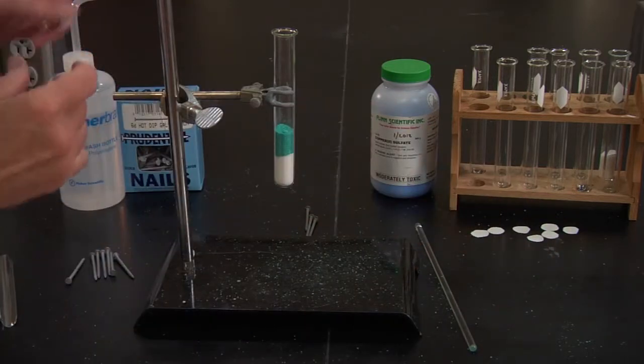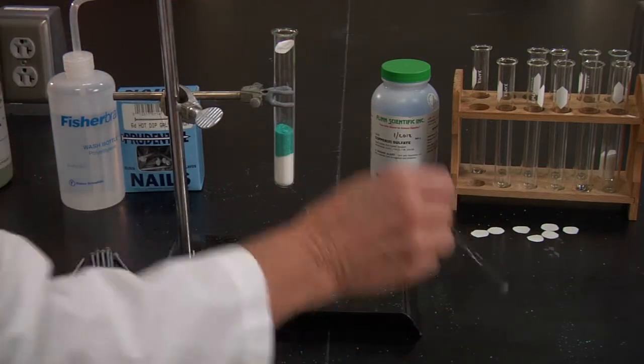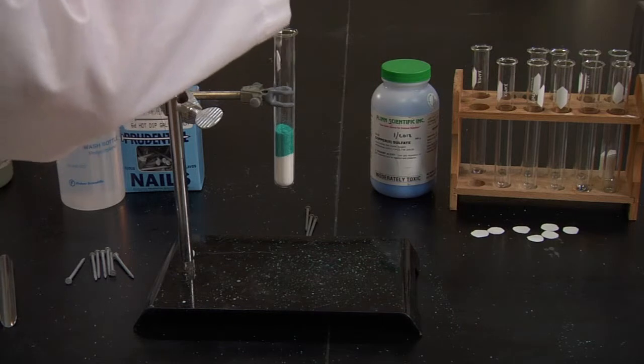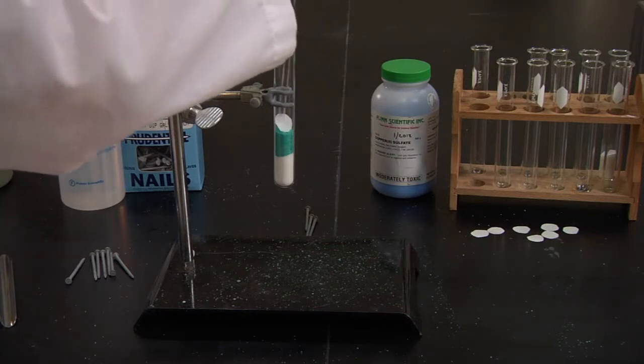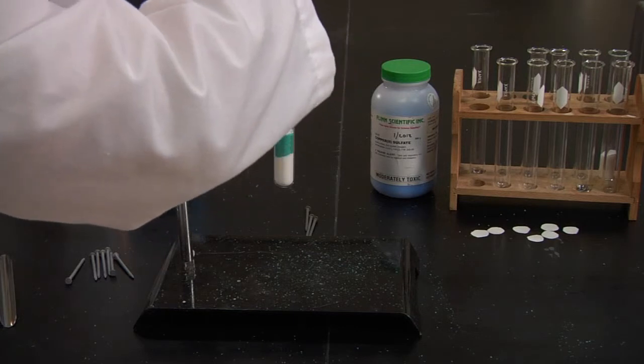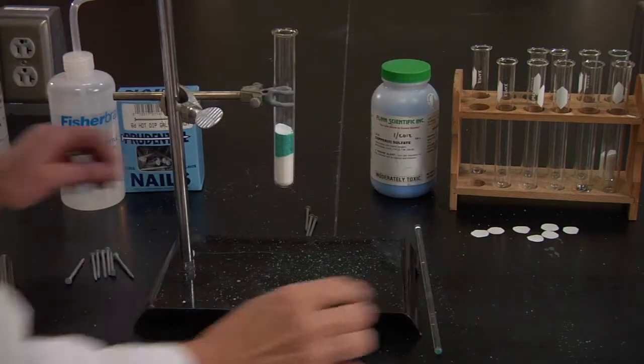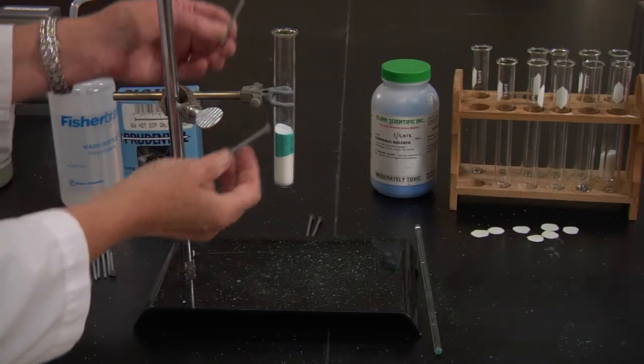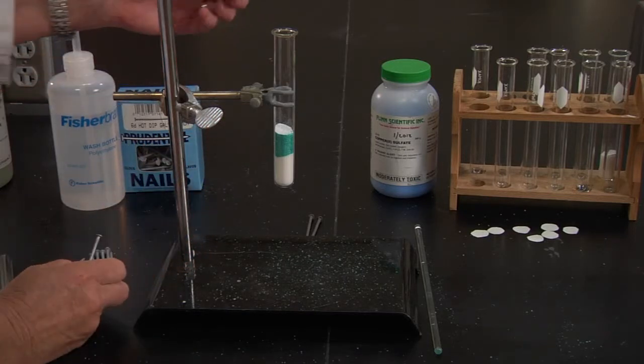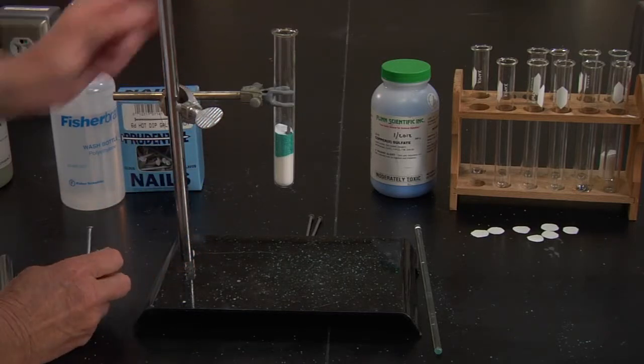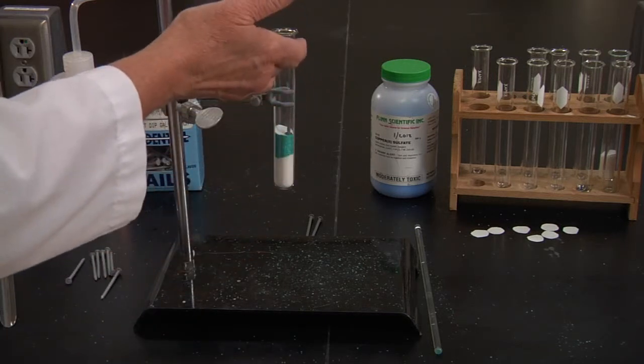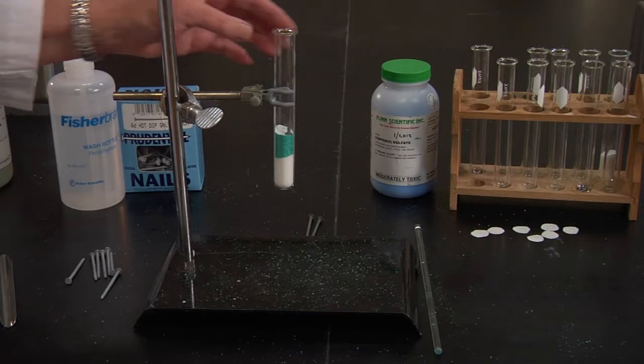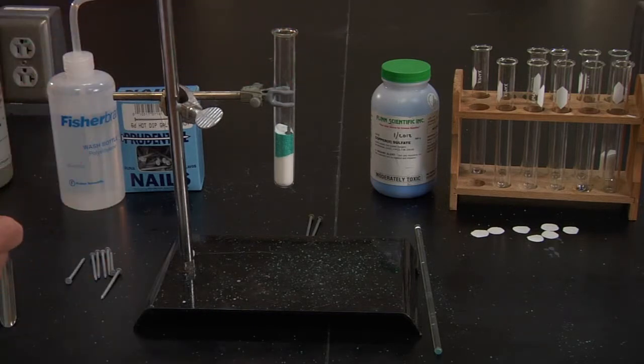Now we have a choice of either the galvanized nail or the iron nail. I'm going to use the regular iron nail for this one. Then we're going to fill this with water, set it aside in our test tube rack, and make observations.